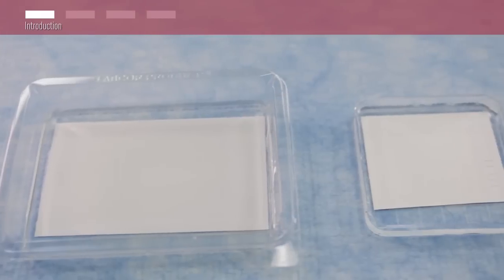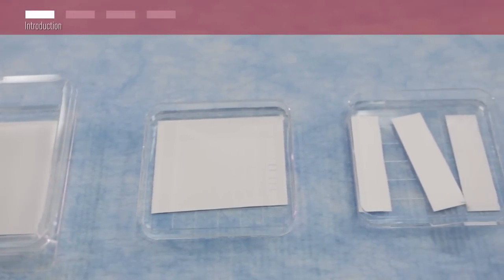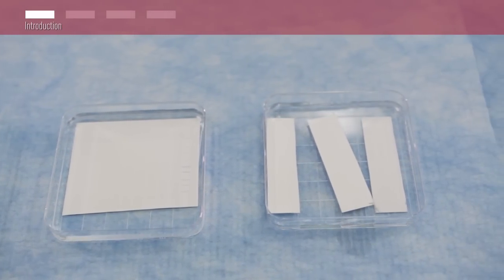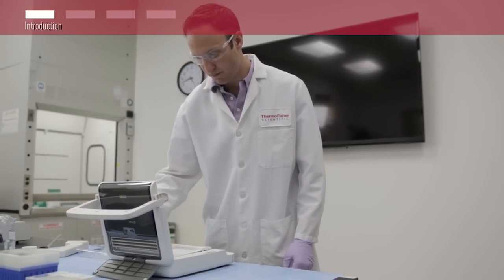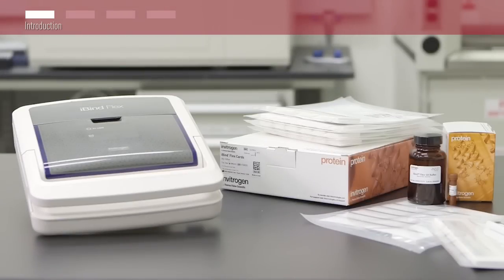Whether you're processing wide format MIDI blots, mini blots, or vertically cut strips, the iBind Flex Western system will add automation, reproducibility, and performance to your Western workflow.